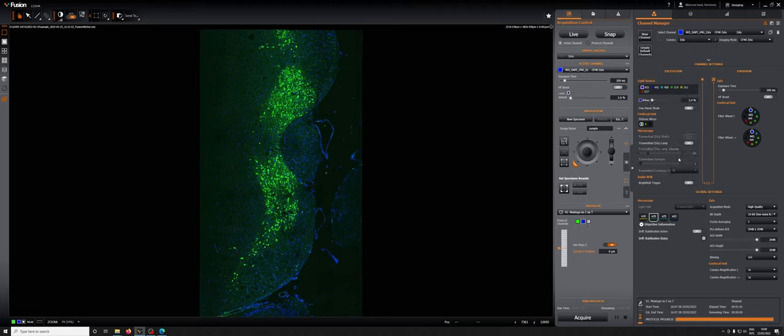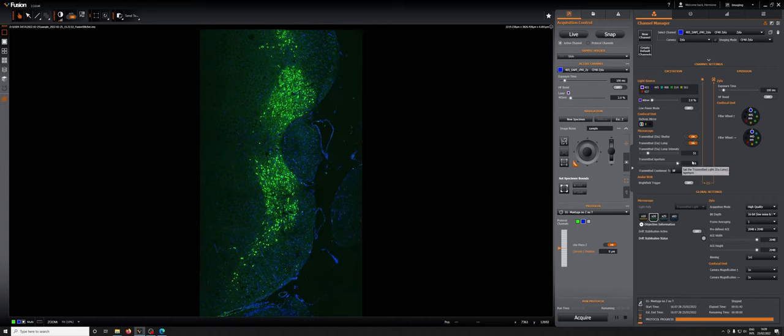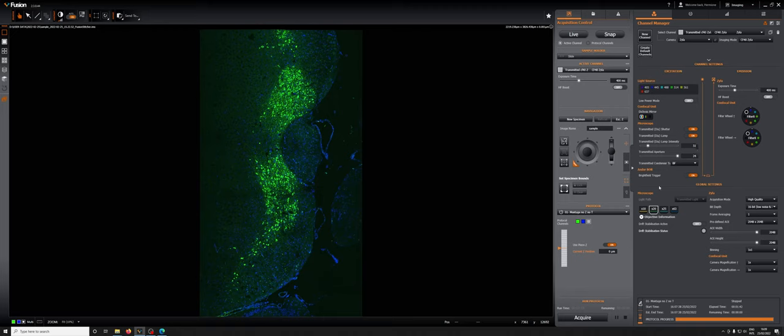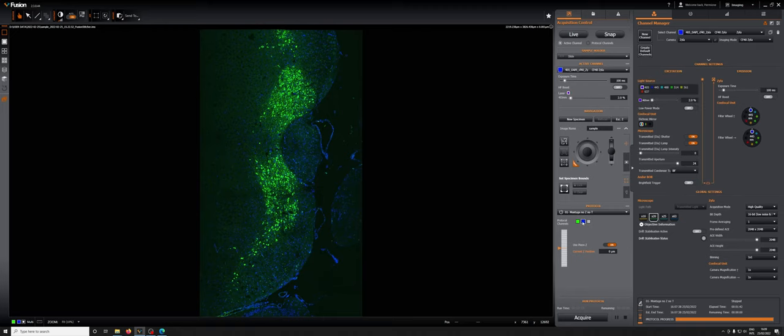Match the aperture to whatever it is on the transmitted light channel and then reduce the intensity to zero. On the transmitted light channel these two things are open, the transmitted aperture is at the maximum in this case, and the intensity is at some number larger than zero. When we go to the fluorescent channels we want to match everything except the lamp intensity which we drop to zero and the same is true for this one.